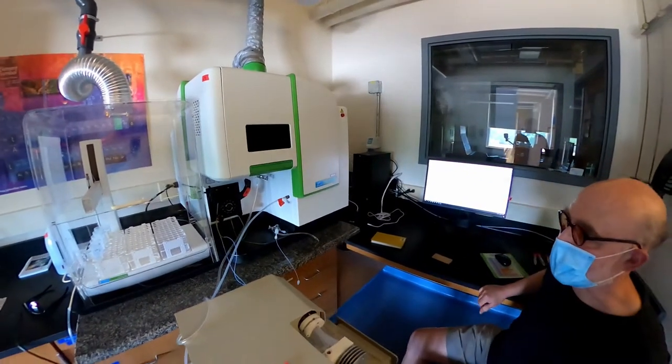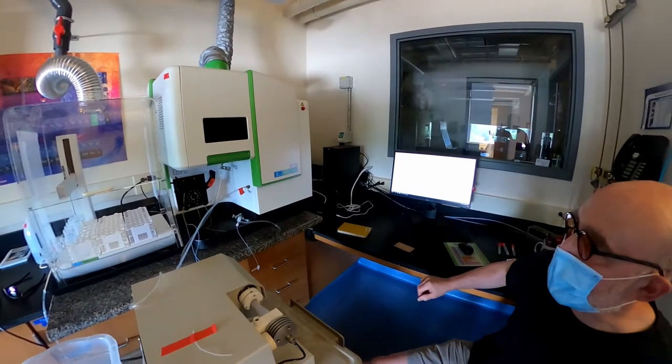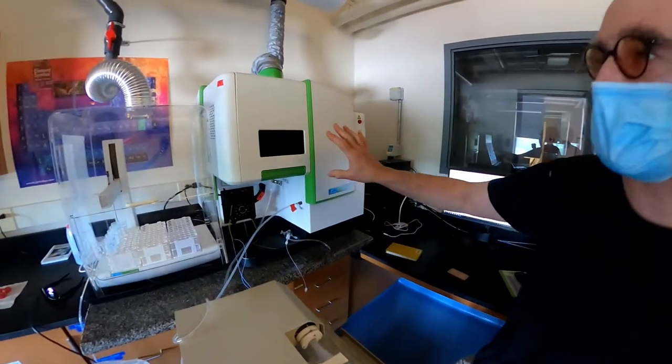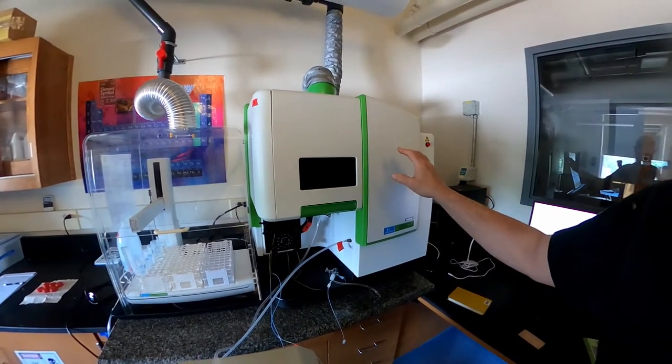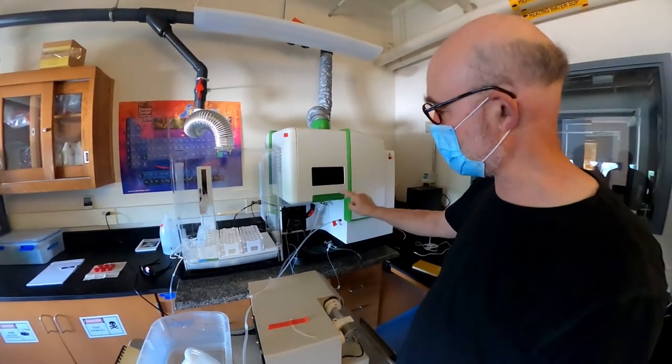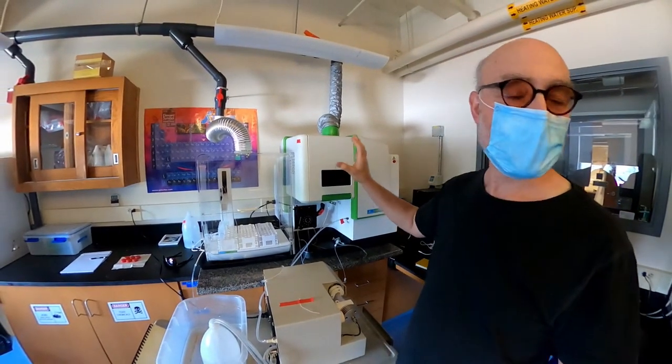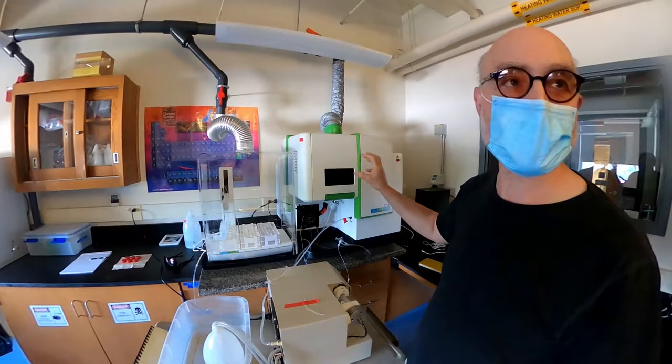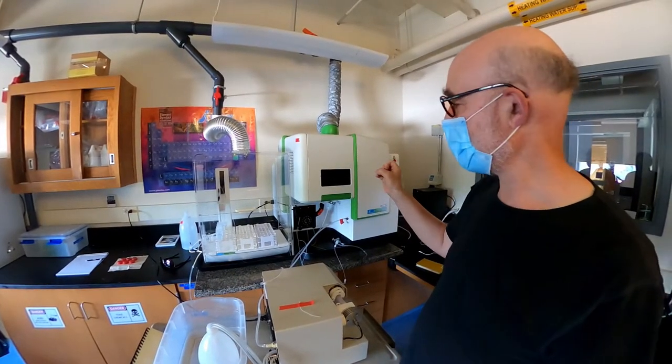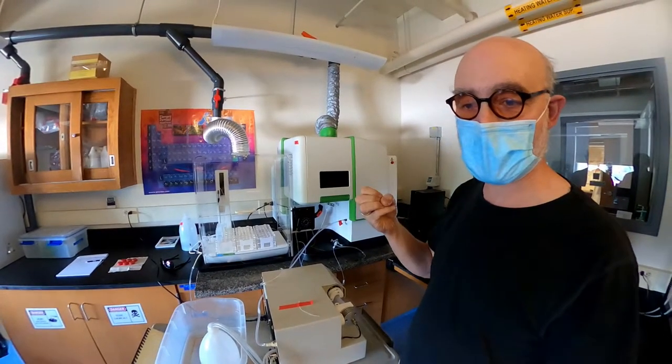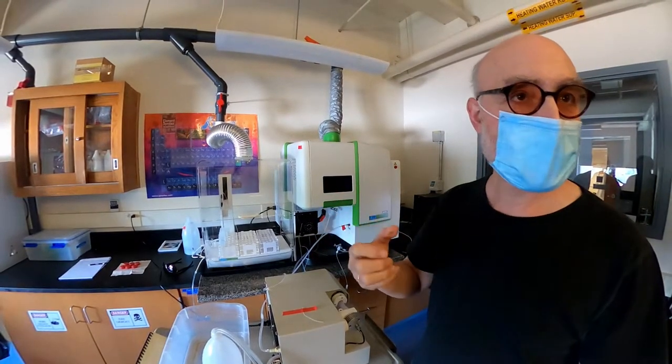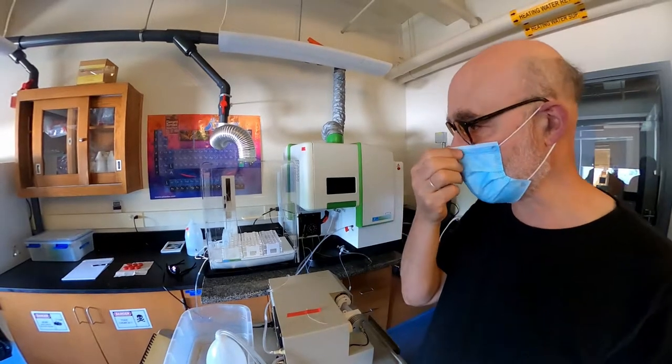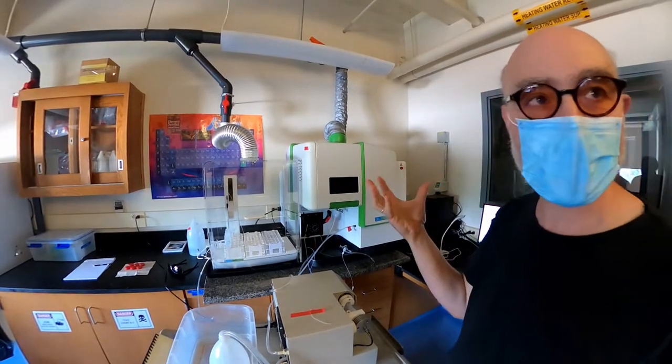So this is the ICP, an inductively coupled plasma spectrometer. It relies on a plasma that we haven't lit yet. And then a diffraction grating to take the light that's emitted from the samples as they're introduced into a plasma. Plasma is a really hot gas is the best way to think about it. That causes the electrons, just as Nico was explaining earlier, in the X-ray fluorescence to change orbitals. Same thing happens here. But instead of X-rays doing the excitation, it's this very hot gas.